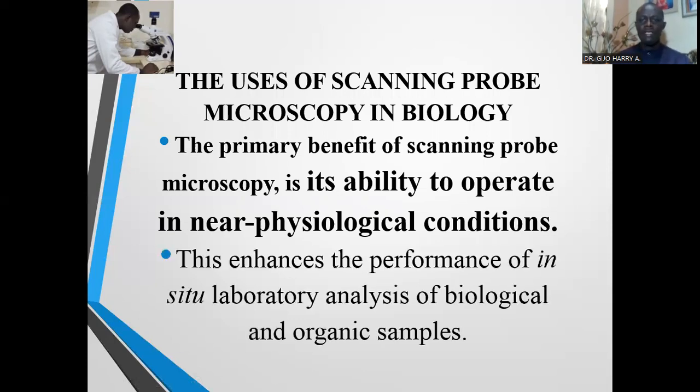This enhances the performance of in situ laboratory analysis of biological and organic samples.